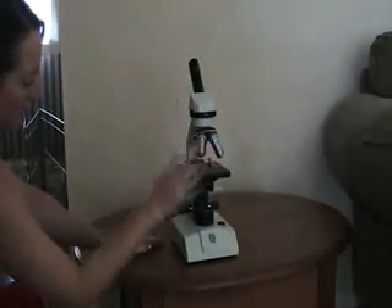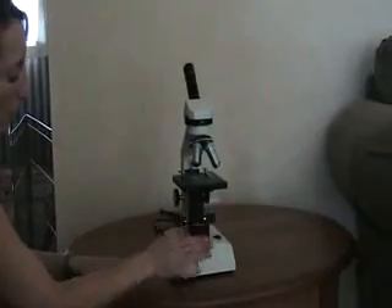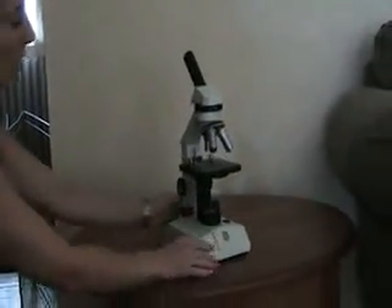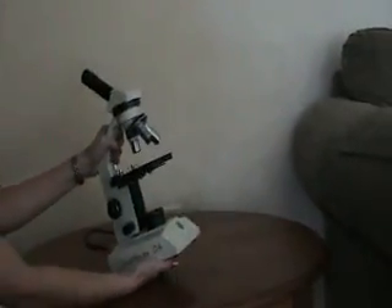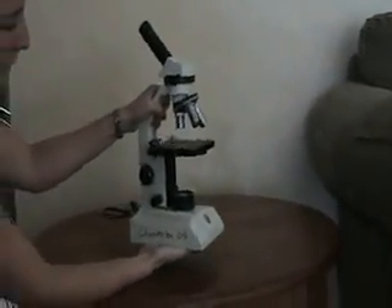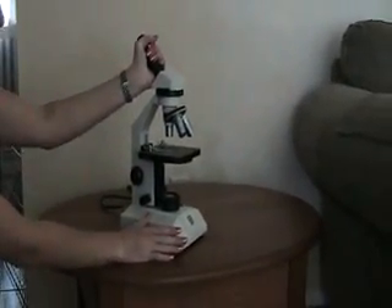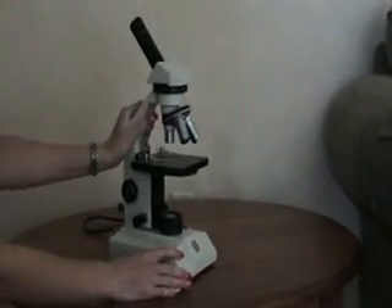I almost forgot — this part is the stage. Going down here, we have the base. Now, to carry your microscope, always take it by the arm with one hand on the base. If you accidentally grab it up here by the eyepiece, chances are it will come off and the microscope will go falling to the ground, and it will be a very sad day.